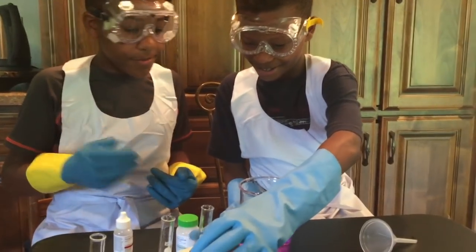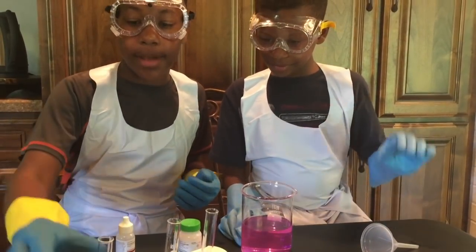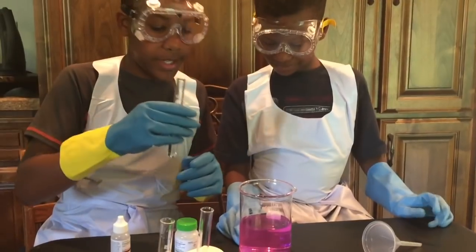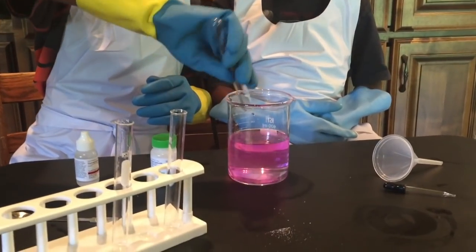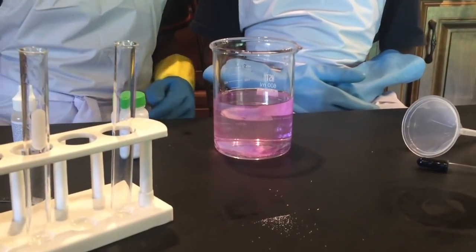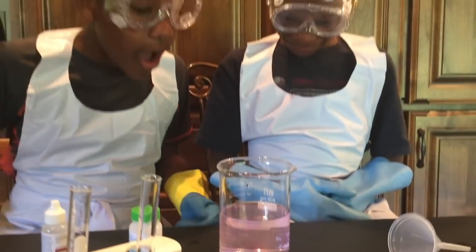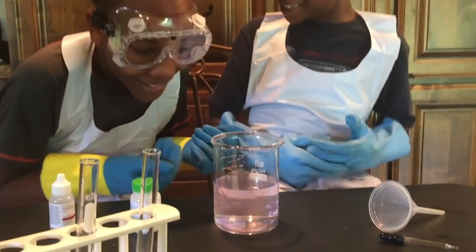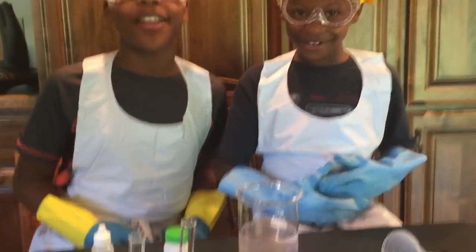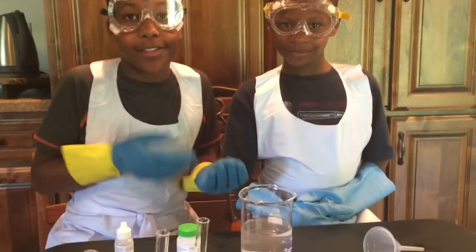Again, we say it's not magic, it's just chemistry. Now we are going to turn the water back clear again by taking this vinegar and pouring it into our beaker. It's turning back clear — and that's how you make clear water turn into pink water and back to clear water.